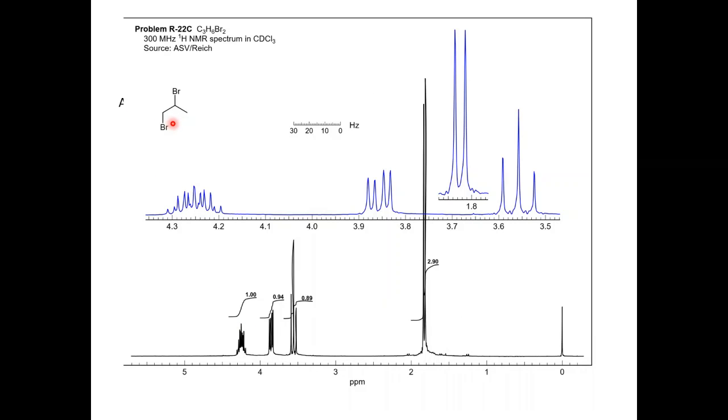So here this is the example of dibromopropane. We see four types of hydrogen: one is the methyl group, and there are three single hydrogens. Each proton has a different chemical shift. So why do we get this doublet of the methyl group at 1.8 chemical shift? Because it is split by this hydrogen. This hydrogen is a little bit complicated. It observes the coupling of this one and feels the coupling constant of that one. This is a doublet of quartet. So DDQ is this type of pattern, which is a little bit complex.